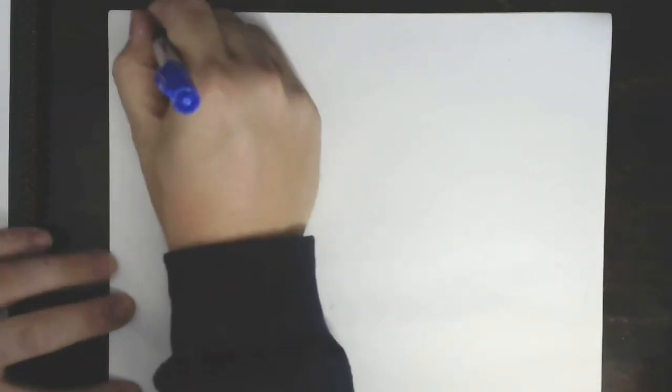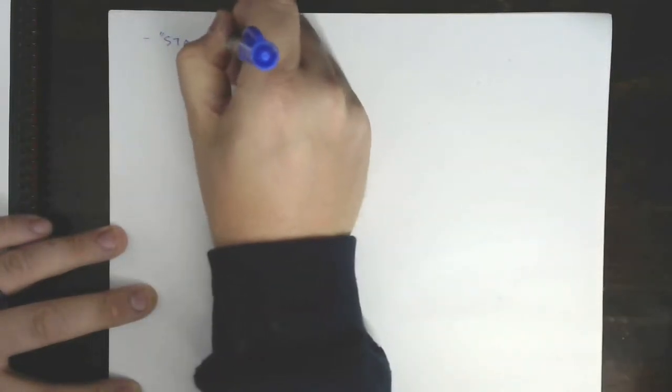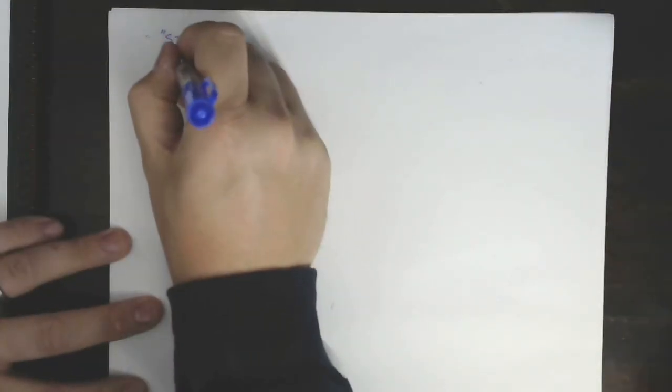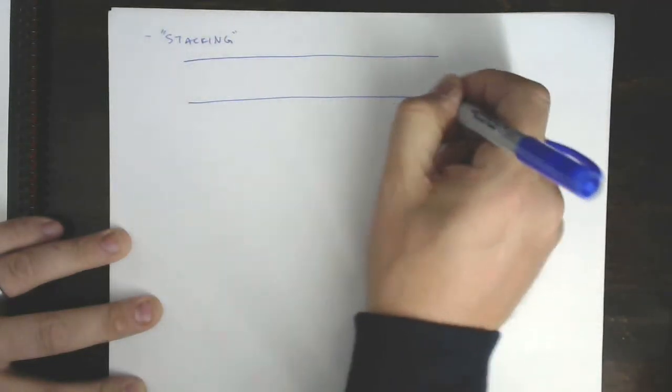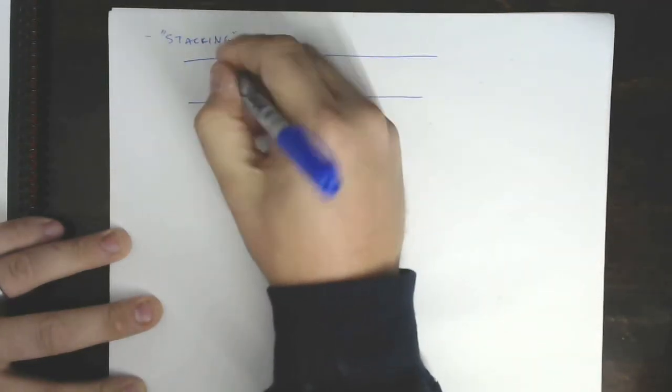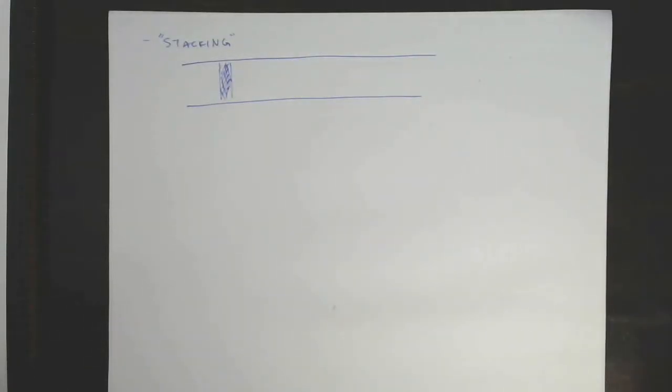Let's look at the other end, the low concentration end, because there's an effect here that can be problematic as well. So we're going to talk about a fairly advanced topic here, something that I generally don't even start out with my grad students doing CE, and that topic is stacking. So to understand what stacking is, let's consider our capillary. Here it is. We're going to inject some plug of sample.